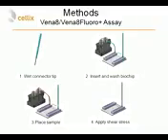During the assay, during the flow of whole blood, several images were taken from different positions of the biochip. Typically we would take up to 7 different positions along the channel, and then one video which captures the time lapse of the platelet aggregation from time 0.0 up to 5 minutes.